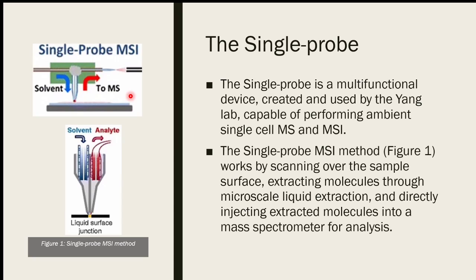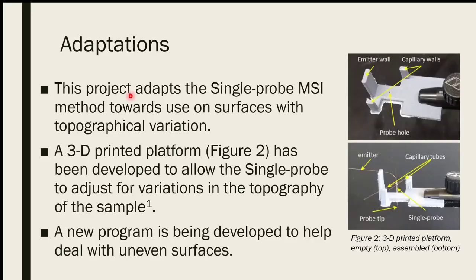What kind of time does it take? Okay, for clarification on that, the probe itself is actually in a constant position. The sample stage is what is being moved. Okay. All right. Yeah. So I will bring it to here. So you can see the probe here, or kind of. It's somewhat hard to see, but let's say that it was positioned here. The sample stage would be directly under this, and it would be moving in relation to the probe. I got you. So the probe is fixed, and then you achieve the movement by moving the sample around underneath. Yes. Okay.